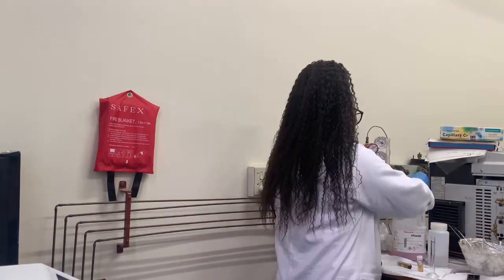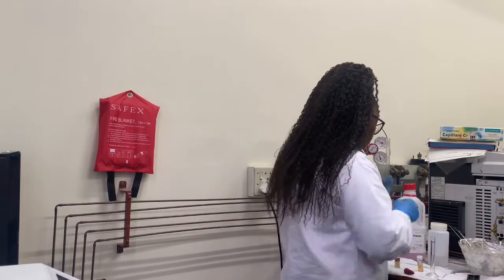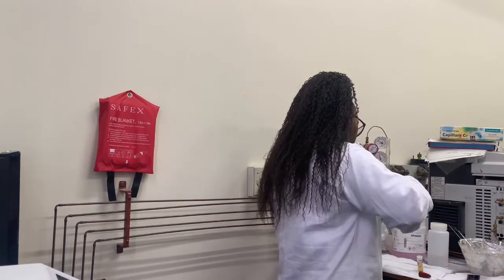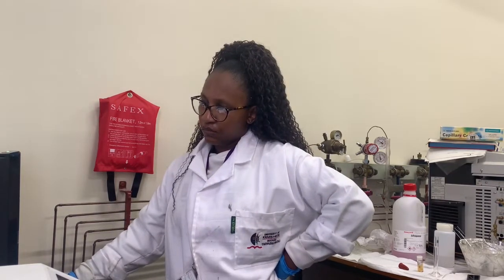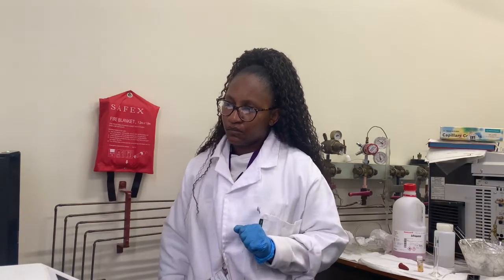I do many samples because I optimize my sample. I start at a very small scale, then optimize if I've seen that my porphyrin is being synthesized. For example, maybe I'll synthesize one in air and then another in an inert atmosphere. So I was just showing you how the spectra looks like and how my samples look like. So yes.